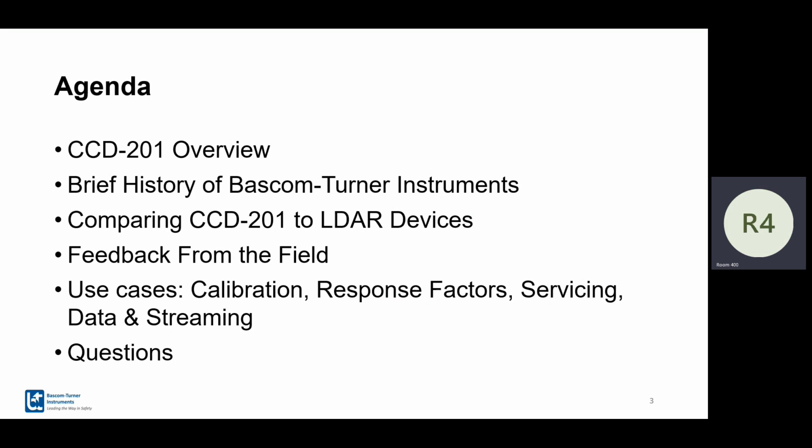Share a little bit of feedback from the field from our customers who are using the CCD so far, and go through a couple of use cases, how we calibrate response factors, and what it looks like to service our units in the field, and what some of our data pull and data streaming requirements are.